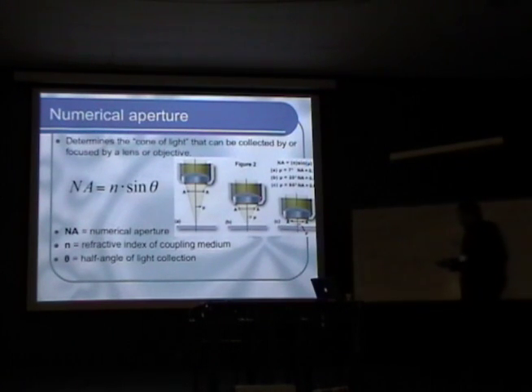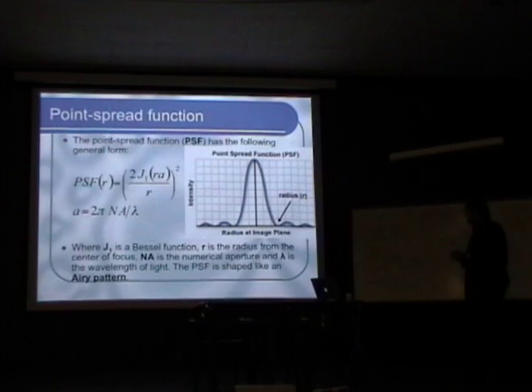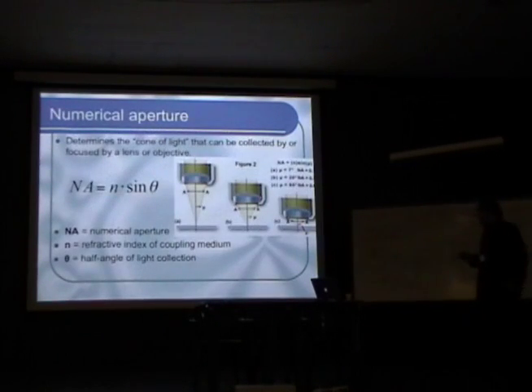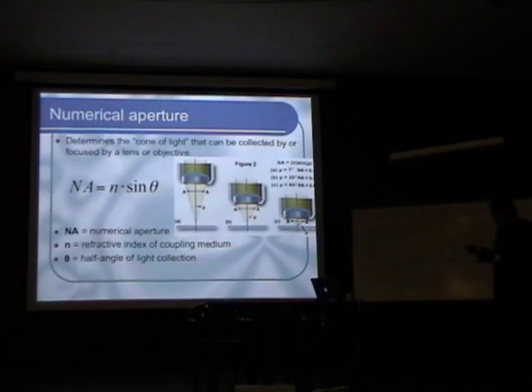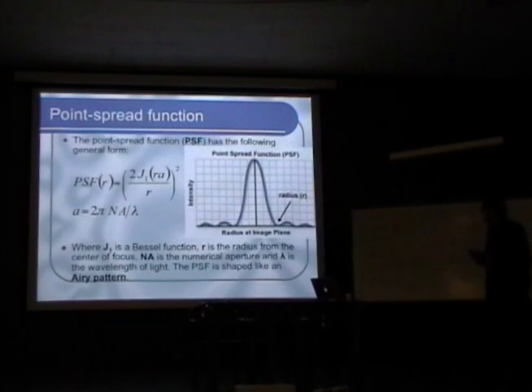And so that means, as we will see a little bit later, there will be some limits on resolution of optical imaging systems utilizing objectives of given numerical aperture. But the higher the numerical aperture, the better resolution we can achieve imaging at the given wavelengths.